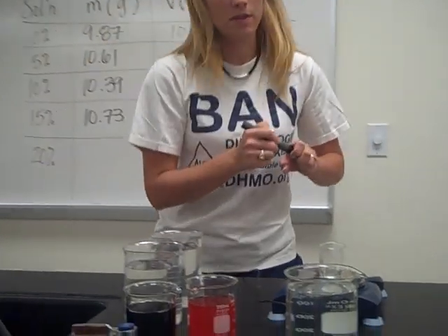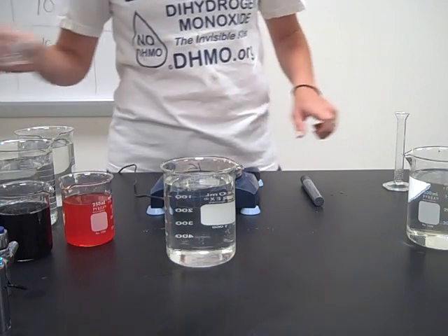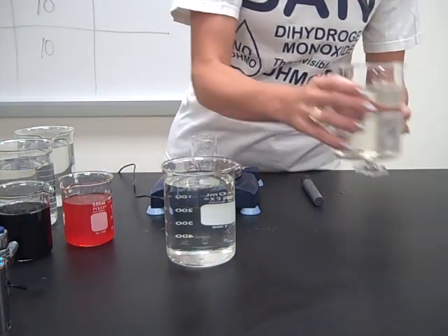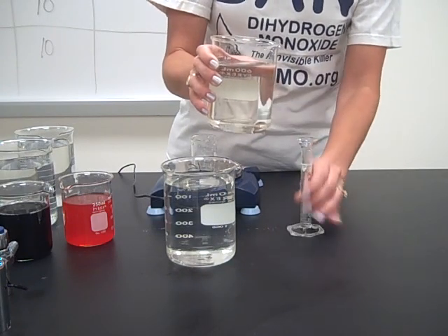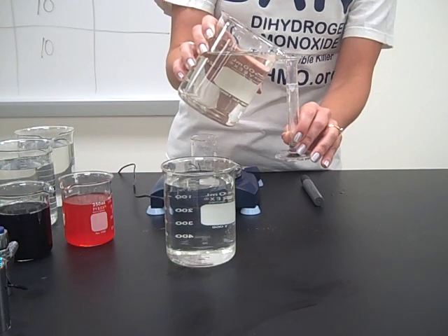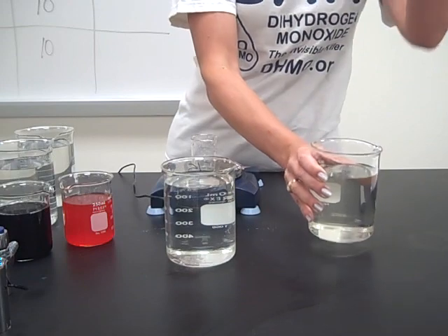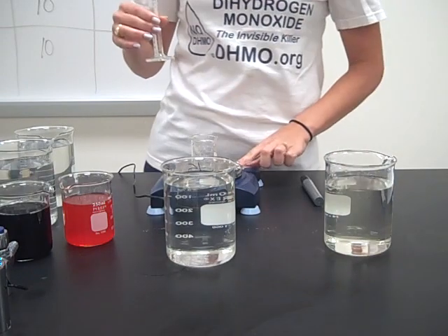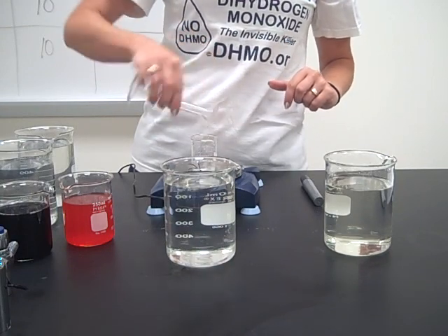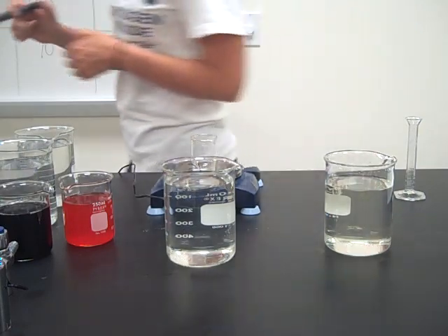And then we're going to do the same thing with the 20% solution. The 20% solution has a mass of 11.35.